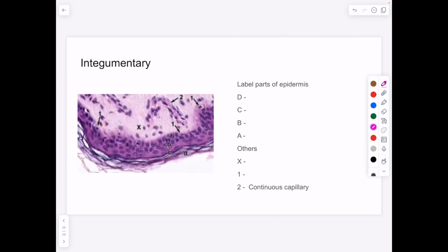All right, different part, we have epidermis again. This appears to be thin skin as well. Come, let's get sunburned. So this is going to be stratum corneum. All right, so that's this guy. This is thin skin, so there's no stratum lucidum. So this is going to be our stratum granulosum. Then stratum spinosum. All right, and that's going to have our keratinocytes in it, producing keratin. And then stratum basale, which is our mitotic layer.